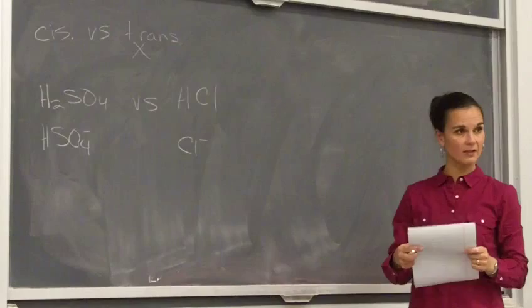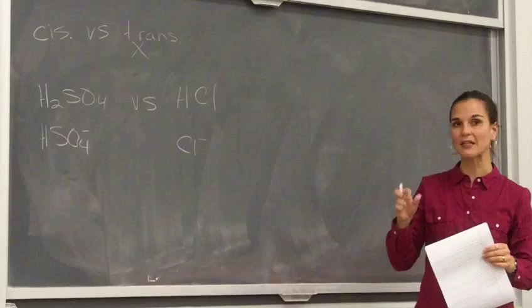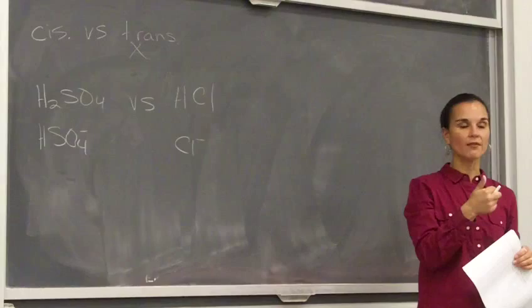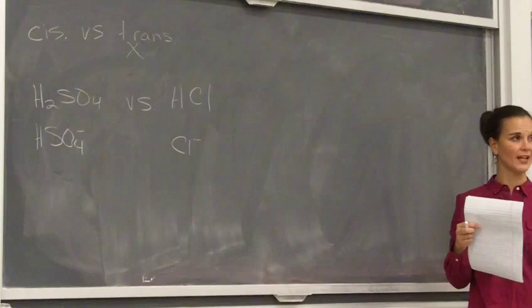Be really careful with it, getting your reaction set up, so on and so forth. Also, we're boiling this, okay? So last week we were just doing a workup with the 9 molar sulfuric acid. We had to be careful handling it. This time, we're going to be boiling this reaction, and we need to be careful because all the glassware is going to be coated with acid all the way through the distillation apparatus that you're going to be setting up, okay? So be careful with handling it, getting the reaction set up, but also be careful when you go to take things apart. A little bit here, I'll talk about the waste disposal as well, okay? But wear gloves this week. The alcohols and alkenes can kind of be irritating, but the sulfuric acid is the big concern we want to be careful with not to get on ourselves, all right?